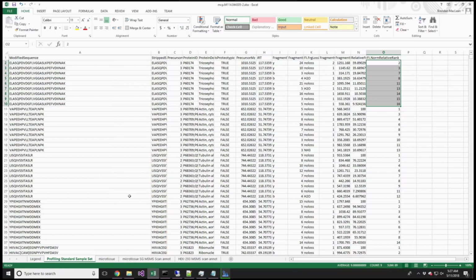The actual tools and processes for coming up with one of these things, you can use this in Skyline because they're in the field, so we made Skyline handle them. But the Skyline workflow is much more like what we can do in maybe this last half hour. We'll go back. I think it's sort of what you did in the tutorial, where you build a library in Skyline and then you use Skyline settings to choose the transitions.